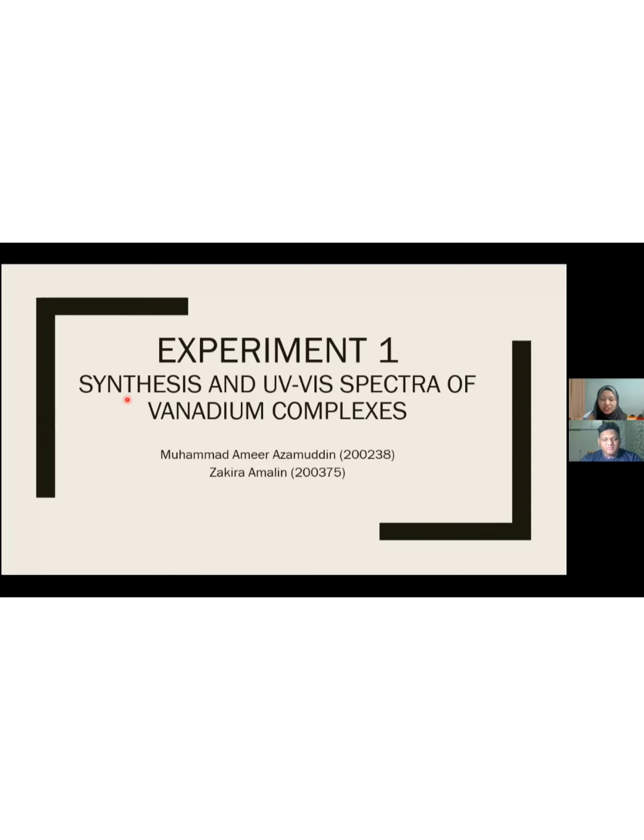And today we will discuss experiment 1, whose title is synthesis and UV spectra of the vanadium complex.